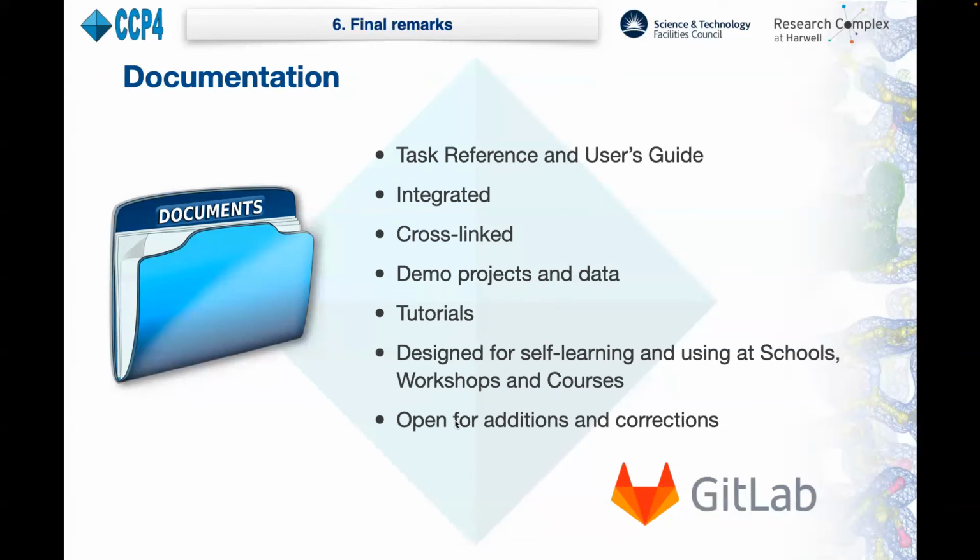Yet another point, a good interface should be self-explicable and it shouldn't require much documentation on its own. CCP4 Cloud is actually more about science than program interfaces, and therefore our approach to documentation was very serious. Our documentation is focused on the essence of cloud tasks rather than interface features like buttons and selection boxes and so on. And it includes a set of tutorials and demo projects for self-education and use in workshops, schools, and courses.